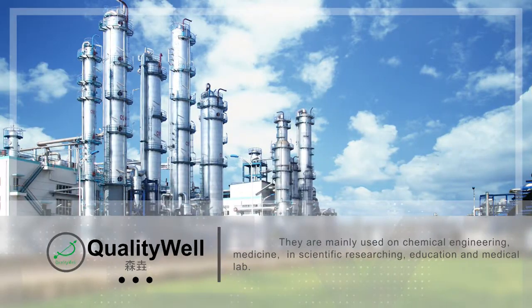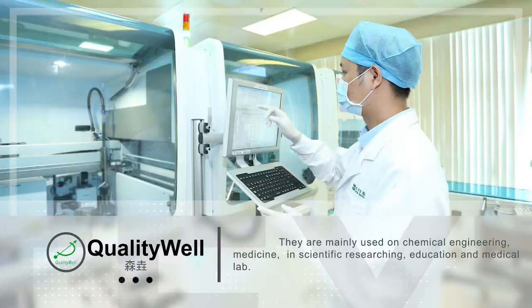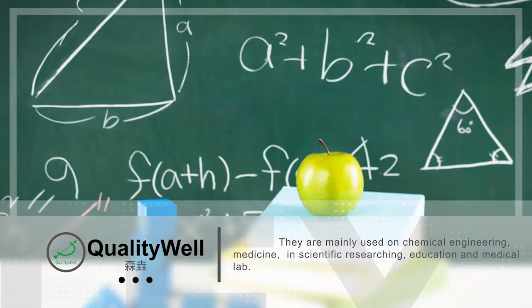They are mainly used in chemical engineering, medicine, scientific research, education, and medical labs.